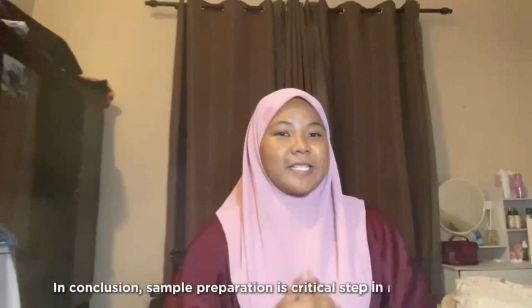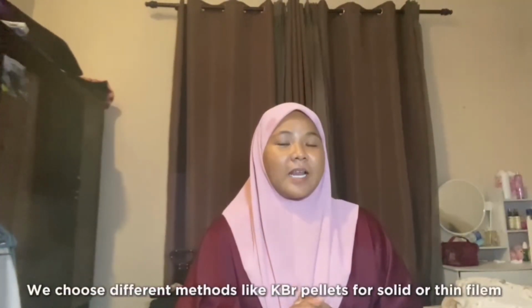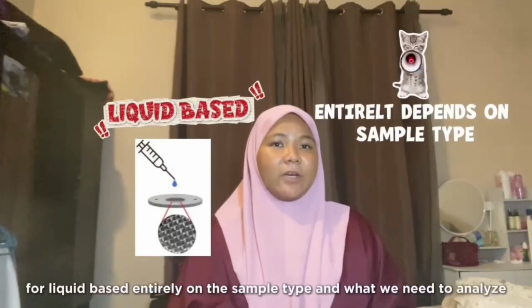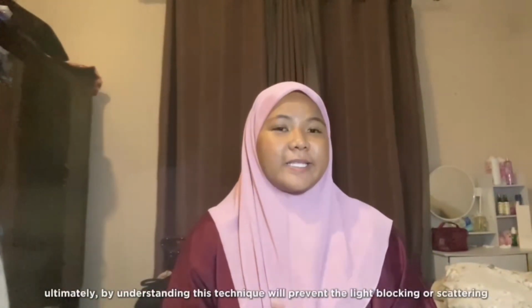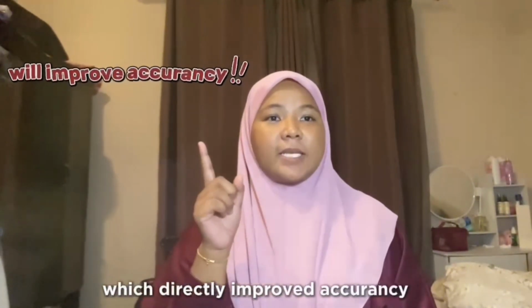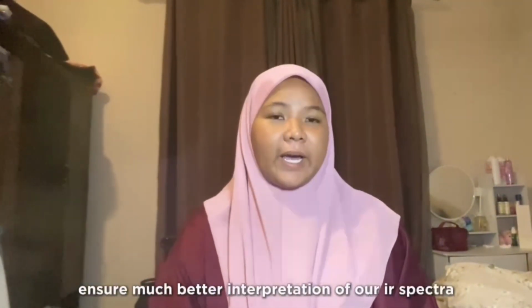In conclusion, sample preparation is a critical step in IR spectroscopy. We choose different methods like KBr pellet for solid or thin film for liquid based entirely on the sample type and what we need to analyze. Ultimately, understanding this technique is key in preventing light blocking or scattering, which directly improves accuracy and ensures a much better interpretation of our IR spectra.